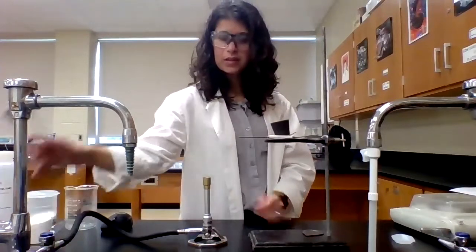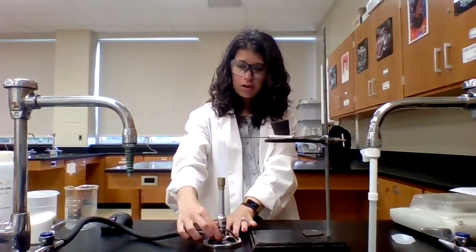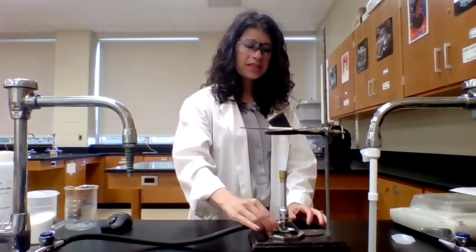I turn on the gas and light the Bunsen burner, and then I can just eyeball from here. All right, let me lower the gas a bit to adjust the height of the flame, and I also want to raise this up just a little bit as well. This part of the Bunsen burner doesn't get hot, so even though it's on, I can touch this. And then you want to let this sit for about a minute, 30 seconds, just to drive off any water that might be present, so that when I weigh this crucible, I have a clean, dry mass.